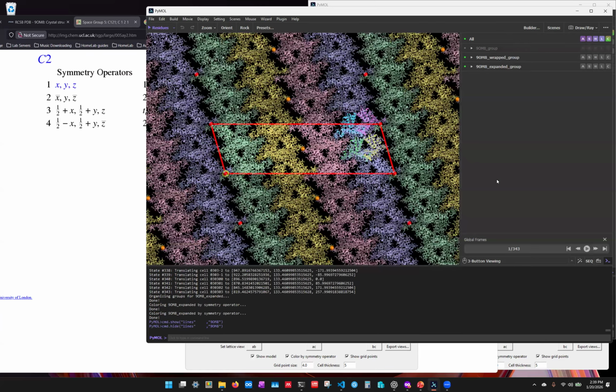Not always, because sometimes the protein will pack easier in one direction, but it's less likely to pack in this direction. It can be hard to tell. Usually the ones that are rectangular are fairly easy to pick up. But I know that the angles are preserved. The lengths, not so much, but the angles between the faces are conserved.